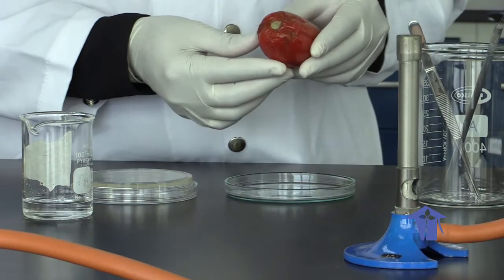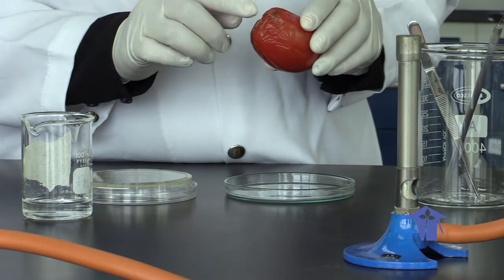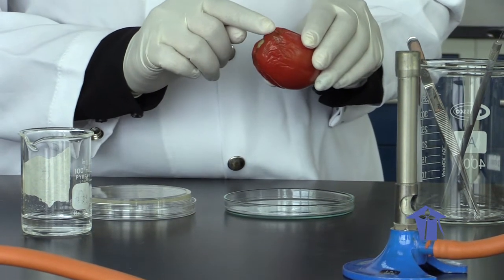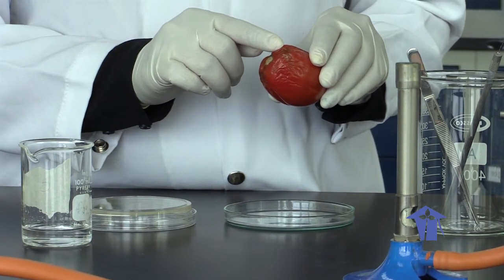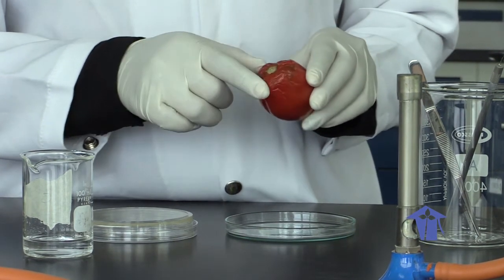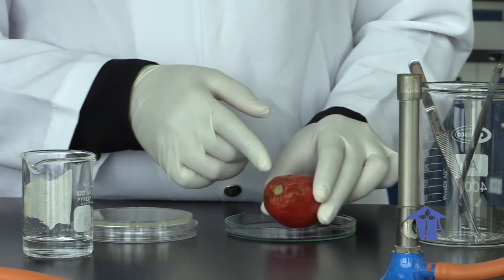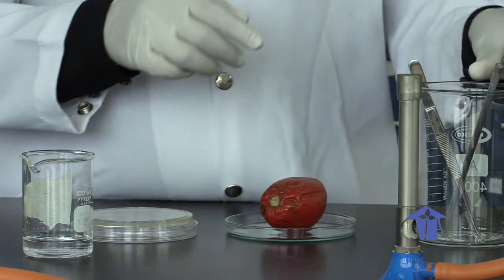So we have our diseased tomato here. We are going to take a sample from the region where you see signs and symptoms of the disease being present. We'll be doing a quadrant streak for inoculation and incubation, to look at the organism after it has been incubated, as well as putting a sample onto a slide to do a Gram stain.